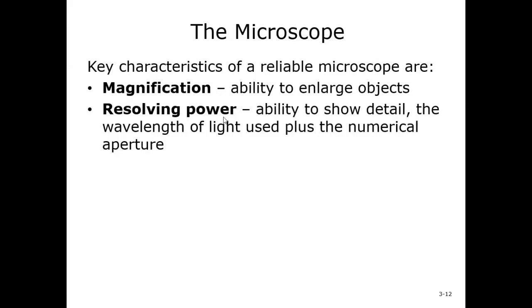Now we're going to go on to talking about different types of microscopy. There's a lot of different types of microscopy, and there's a lot of different reasons we would use different types. So before we jump into the different types, there's some terms you need to know. Now, these two are very basic terms.